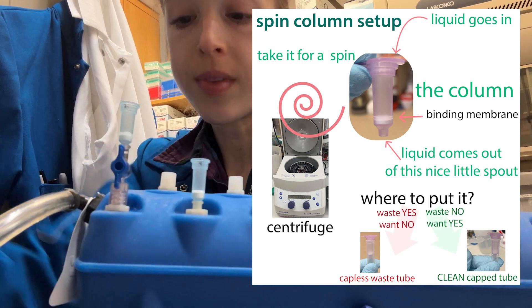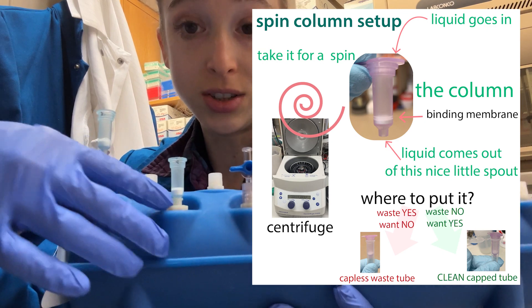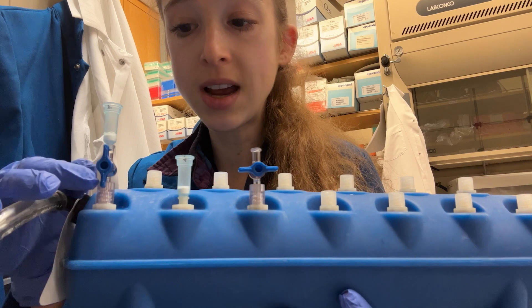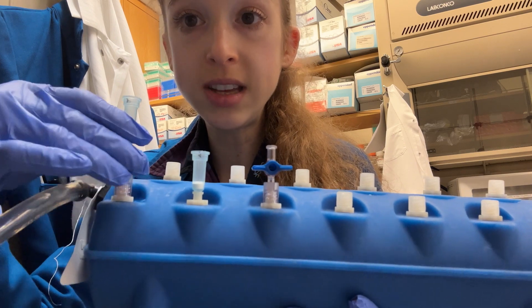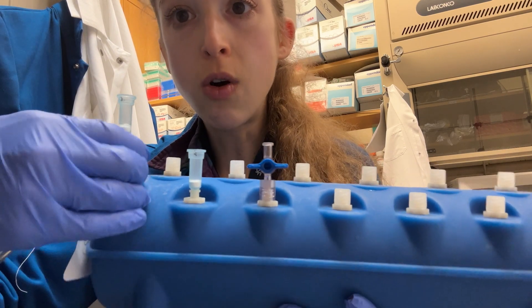You can either put your columns through a stopcock or directly onto the manifold. If they're directly on here, then you control them all at the same time. If you have the stopcock, you can either keep them open to control them all at the same time, or you can control them individually by turning the stopcock so that it's closed or open.